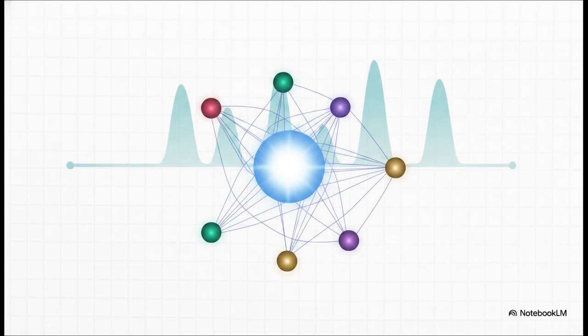To read this fingerprint, we look at the g factor, which acts somewhat like a chemical shift. But even more importantly, we look for hyperfine interactions. You see, local nuclei near our unpaired electron act as even tinier magnets. They add to or subtract from the main magnetic field, splitting our main signal into multiple distinct lines. This tells us exactly which atoms are physically sitting right next to the unpaired electron.